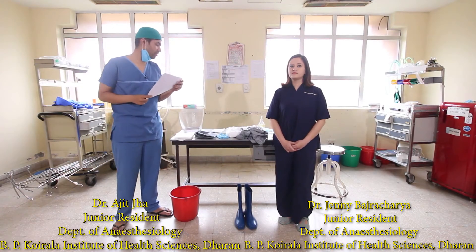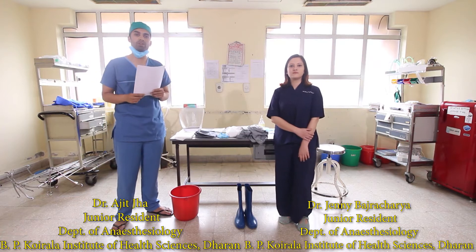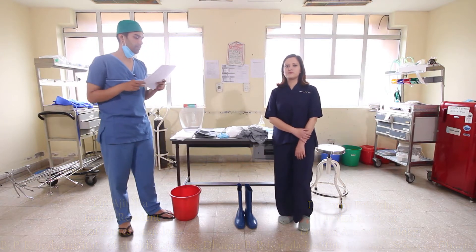After we have reviewed the components of the PPE, we shall now move on to donning the personal protective equipment. I am the donning buddy; she will be performing these steps and I will read out as she performs them.